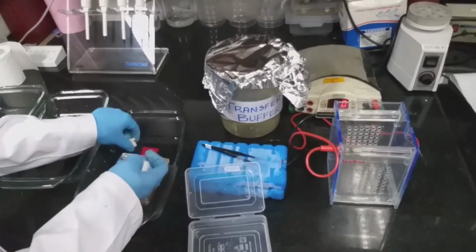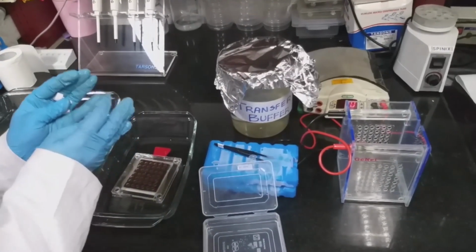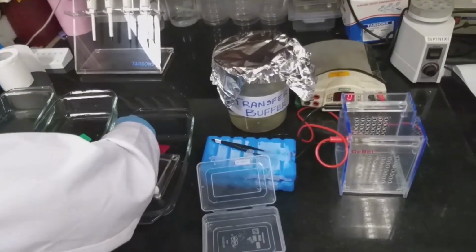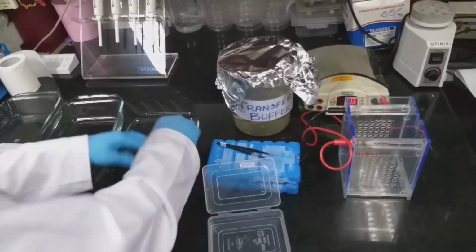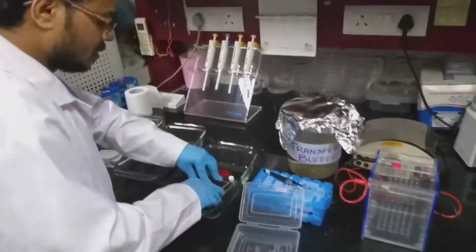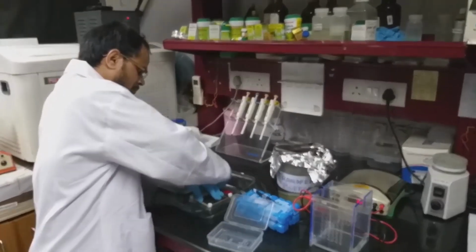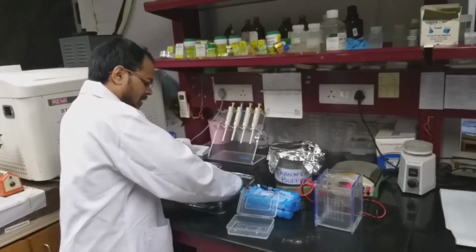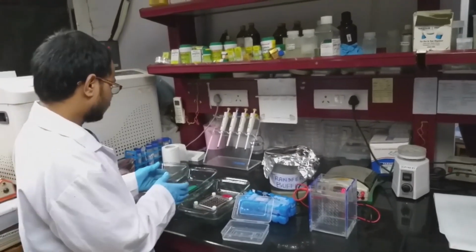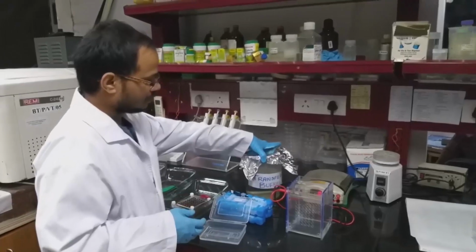These are the screws. We have to tighten them up. Only then will the contact between the gel and the membrane be sufficient for the transfer. Initially you don't tighten, you just keep it, and after that press the positive side of the cassette, then tighten the screws. All these things should be done in the transfer buffer only unless specified. So this is the chilled transfer buffer.